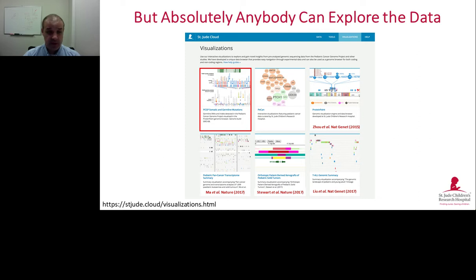But I'd like to zoom in on our new one. This is a software we are calling Genome Paint, and it is a new genome visualization engine powered by Protein Paint and Shinjo's visualization team here at St. Jude. I'm going to hand it over to Clay, and he can walk you through P53 and some interesting mutations as visualized through Genome Paint.